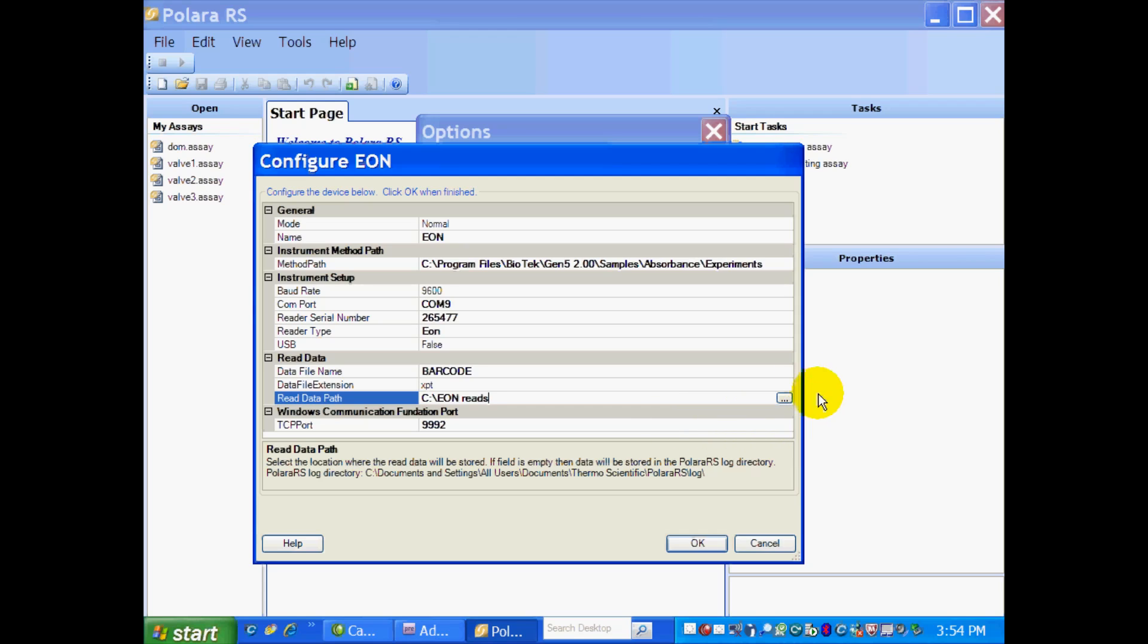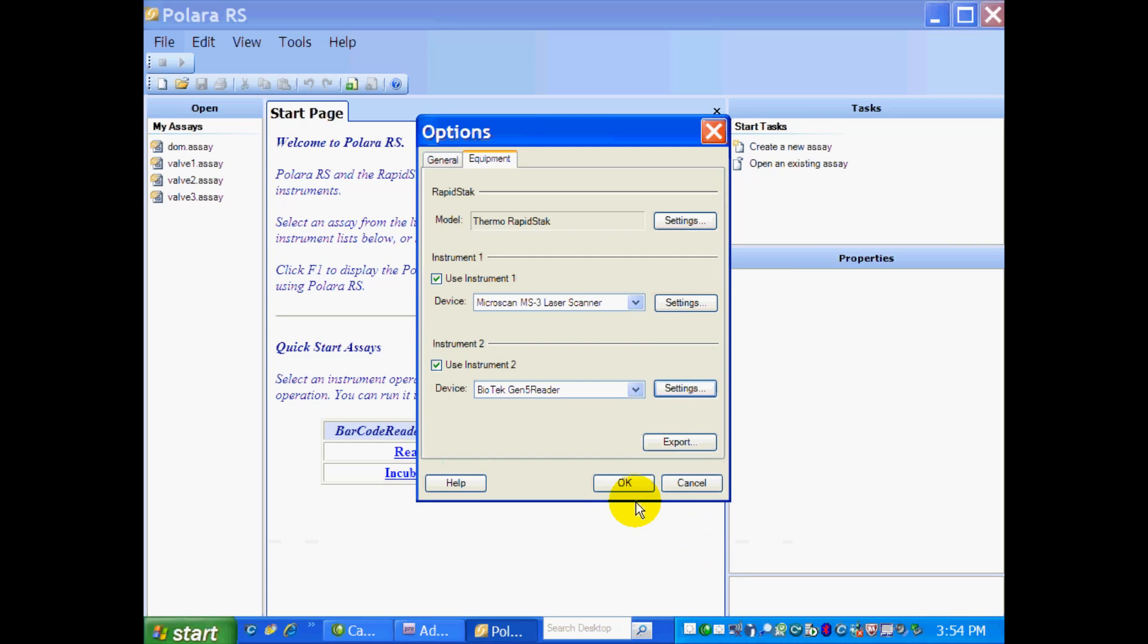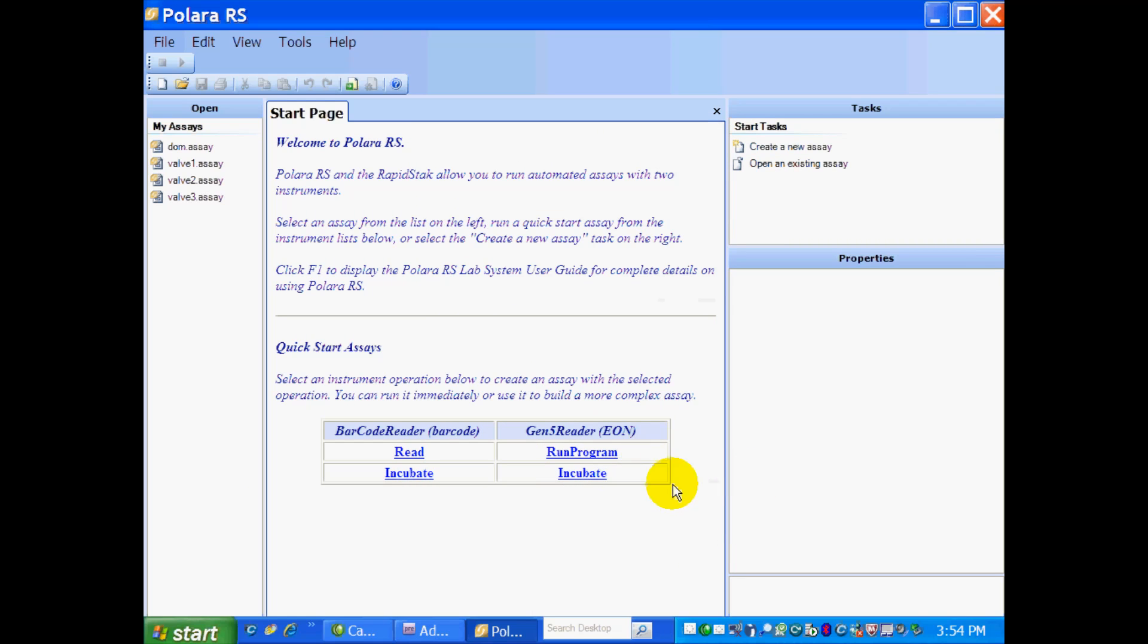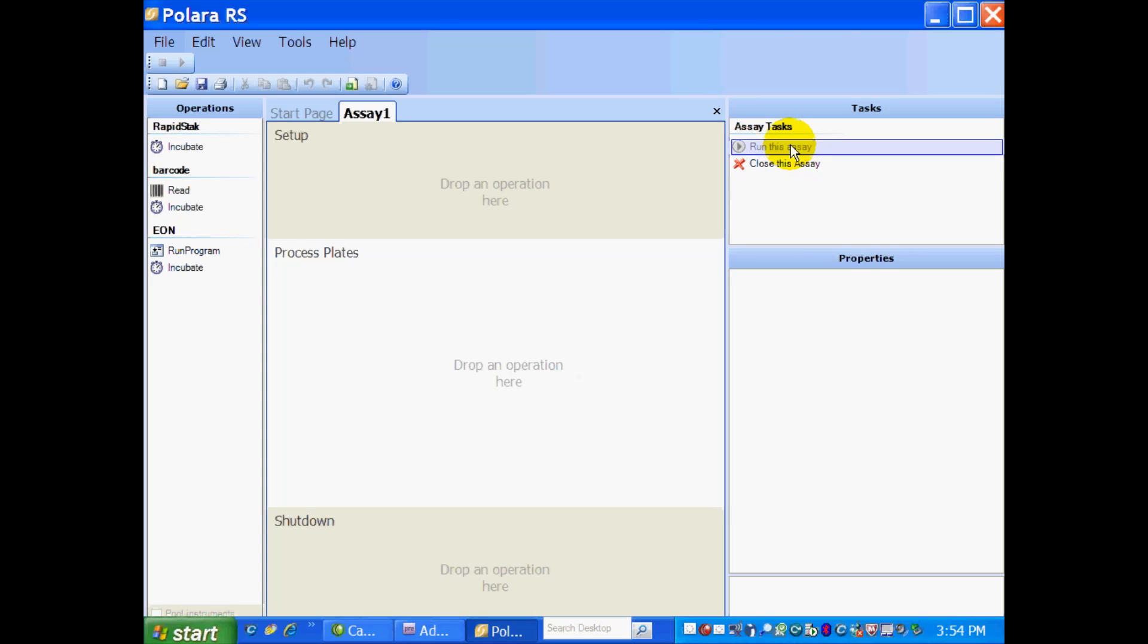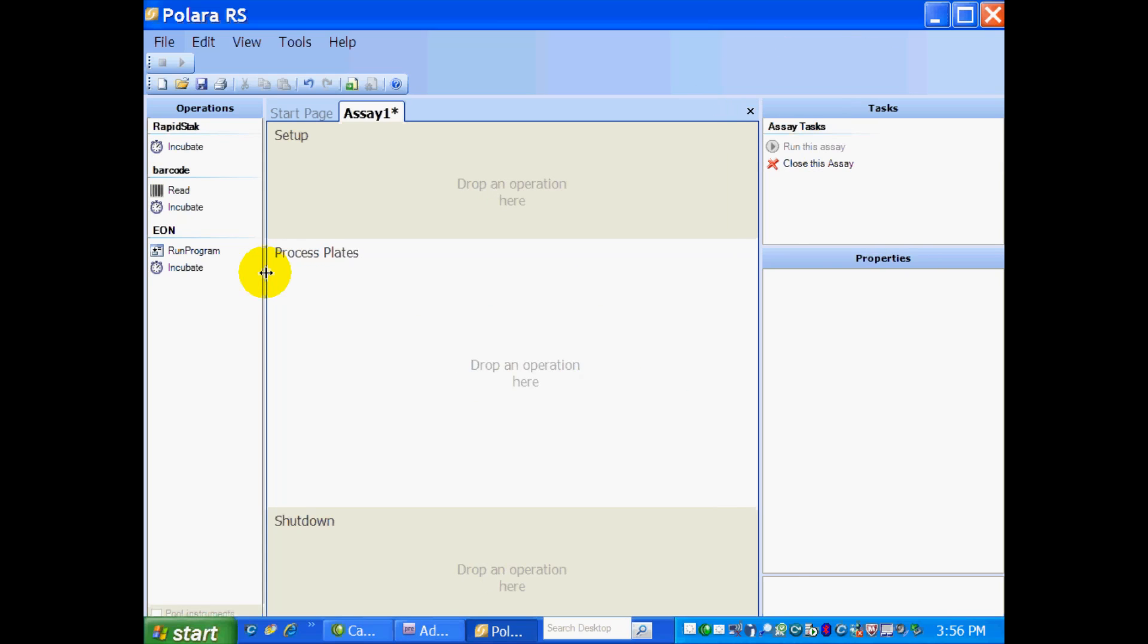Again, if you would like to change that, you just click on the three dots here. So all you do now is you hit OK. And OK again. Then up here under the Tasks panel, you want to select Create a New Assay. So this takes us to our Process Editor.